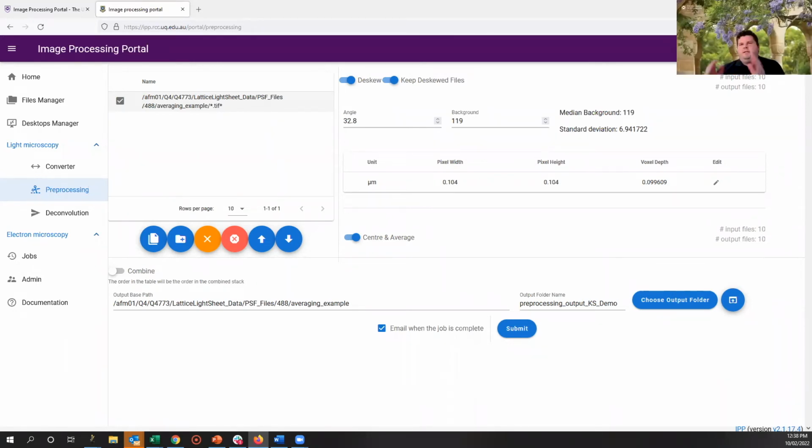Yeah, so the de-skewing is certainly not only commercial. There's open source, and just the other day, open source GPU accelerated de-skewing. So that's going from that kind of slanted back to a normal traditional shape.